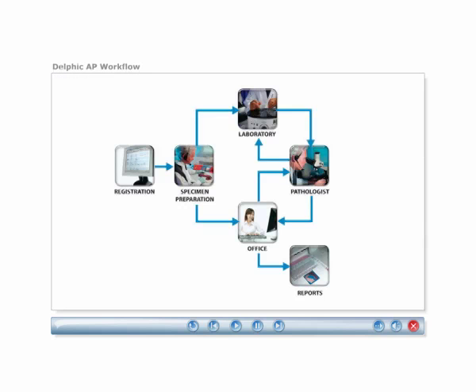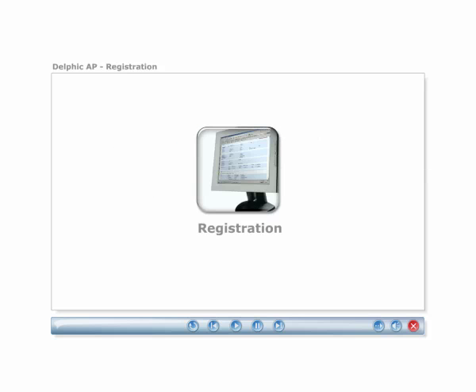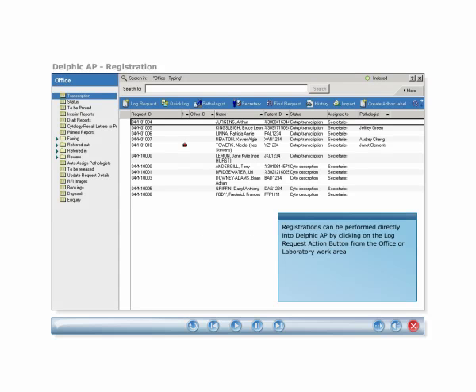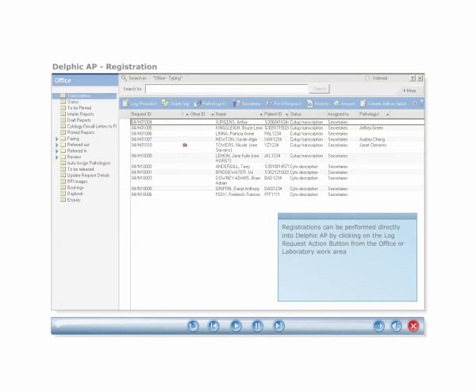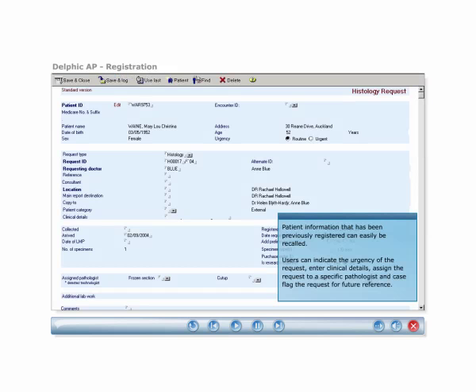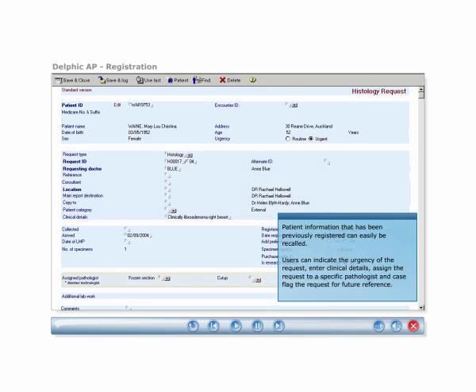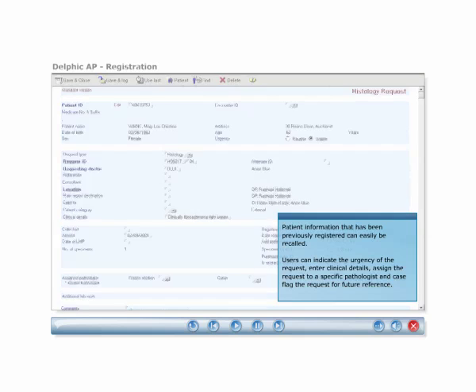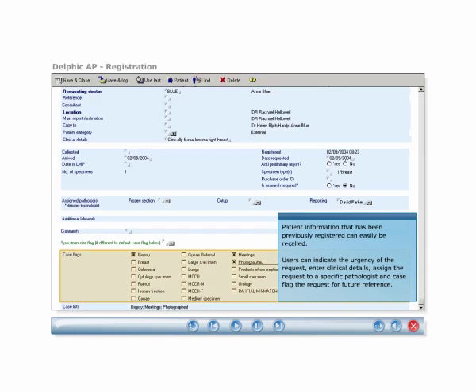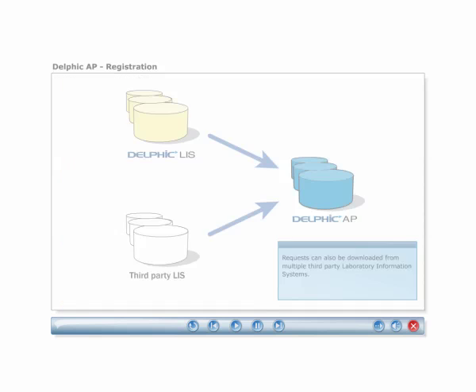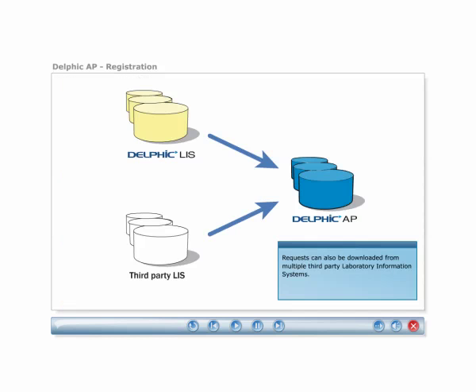Let's take a look at how Delphic AP works in a typical surgical workflow. Registrations can be performed directly into Delphic AP by clicking on the log request action button from the office or laboratory work area. Patient information that has been previously registered can easily be recalled. Users can indicate the urgency of the request, enter clinical details, assign the request to a specific pathologist, and case flag the request for future reference. Requests can also be downloaded from multiple third-party laboratory information systems, including the Delphic LIS.